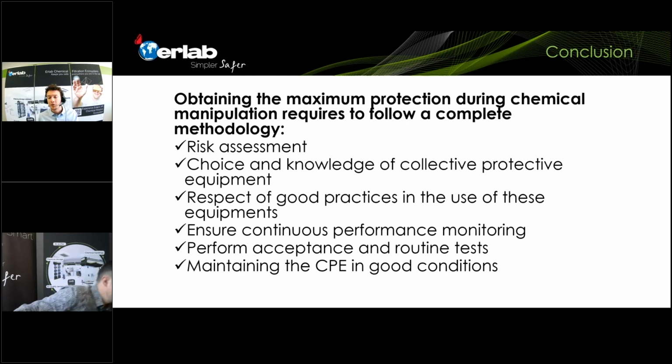Otherwise, we have a lot of customers who dispose of the filters themselves through their proper chemical waste system or company. We in France, for example, go to our customers and pick them up ourselves and send them to a company called Veolia, who is going to incinerate them and use the energy of the incineration for other things in their company. So I hope this is a response to your question. But of course, you will never reuse a carbon filter. That's for sure.